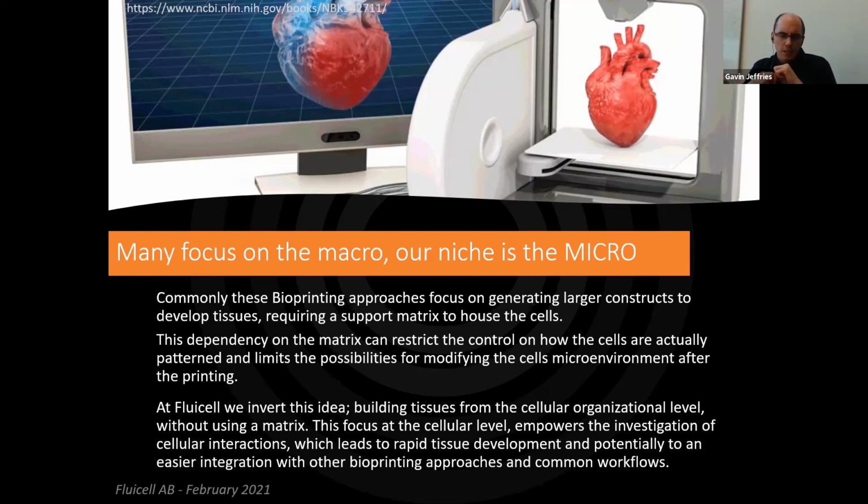And this lack of any sort of matrix or any obstacle between the cells leads to rapid tissue development, and also potentially to easier integration with other bioprinting approaches. The cells are available to be addressed by other technologies. And this also should aid in integration with other common workflows.